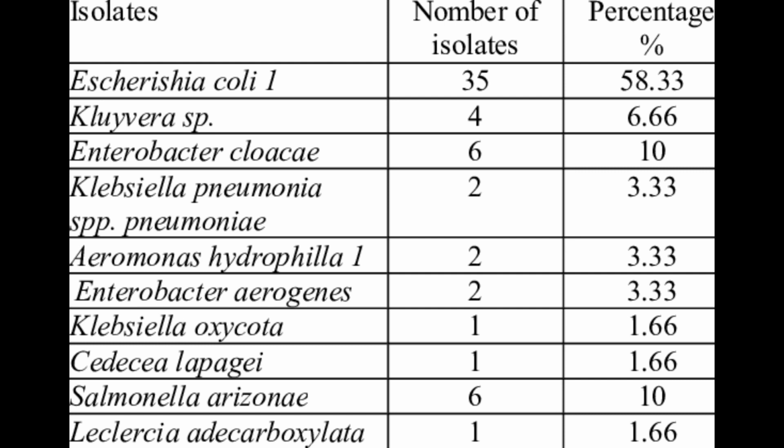Now, let's look at the control. This indicates that the LIA can also detect H2S production. However, compared to the TSI, LIA is less sensitive for H2S production.